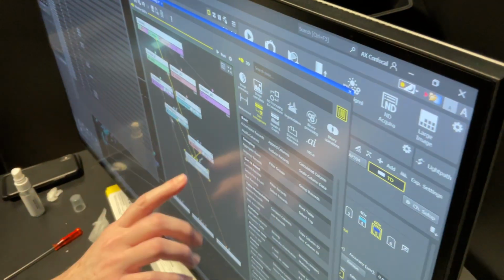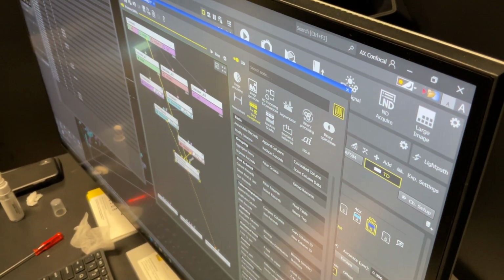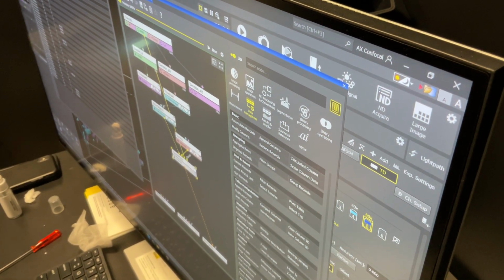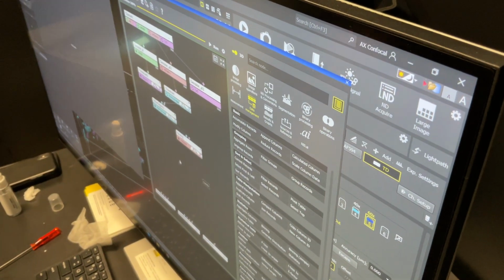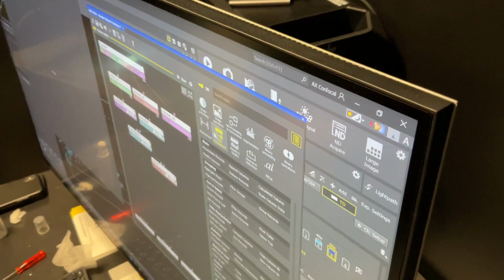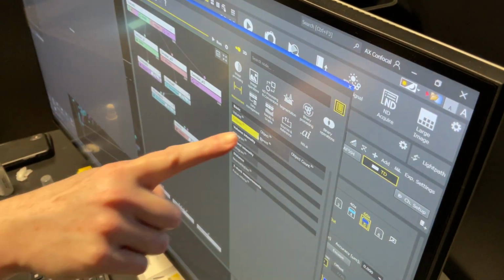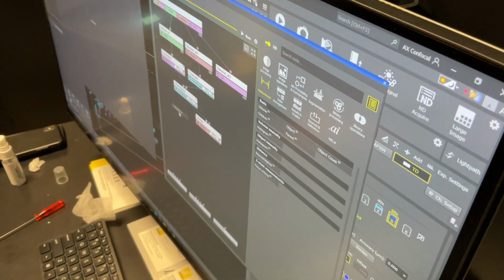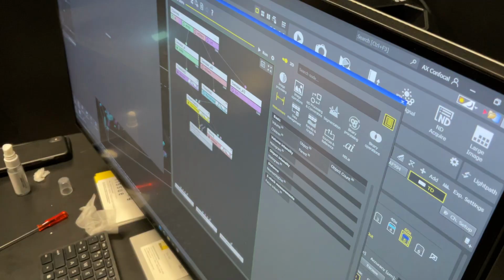Okay, first of all, just remind me. So let's delete this one. We just right click on it, or hit the little trash can, and then we go back to measurement. So grab the Object 3D project, and then just drag. You link to the binary, and then you link to the channel you want to measure.